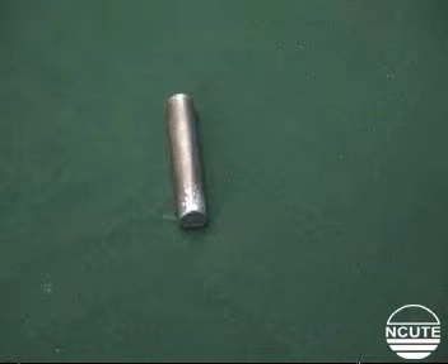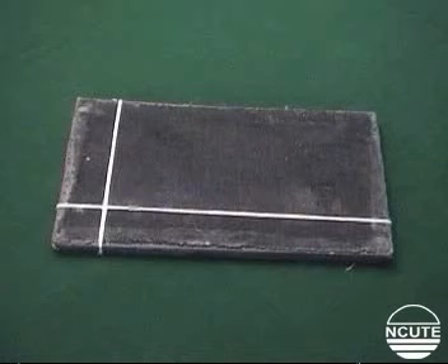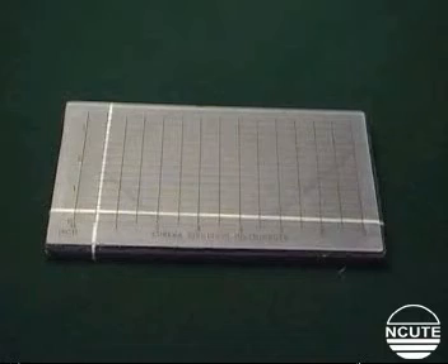This metal piece helps to position the fibers. This black velvet pad is the surface on which the fiber array will be developed. And this plastic scale is for making measurements.